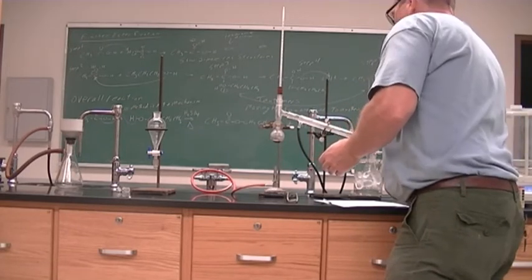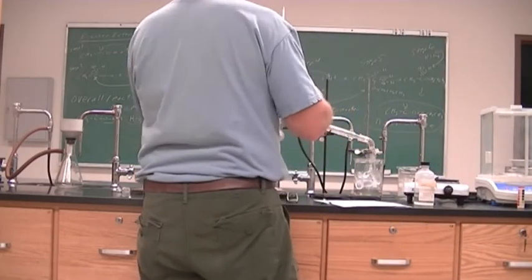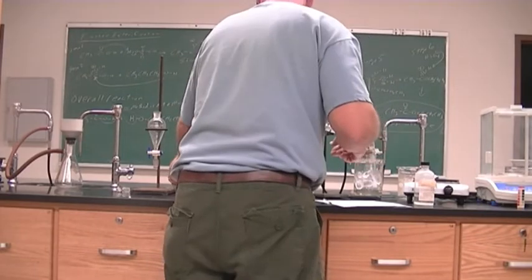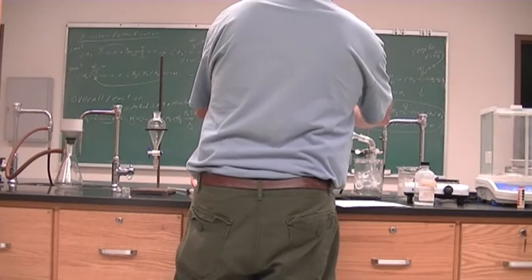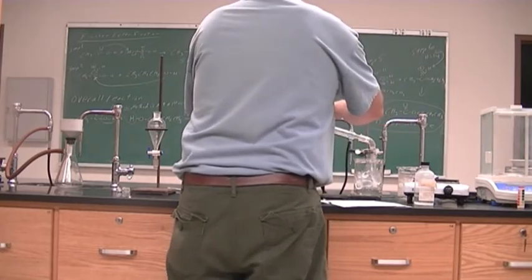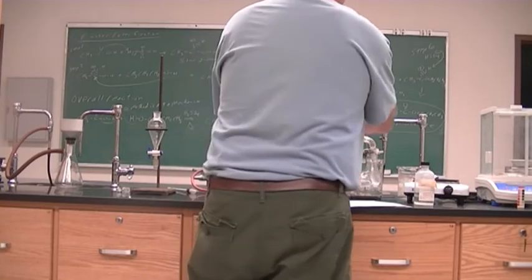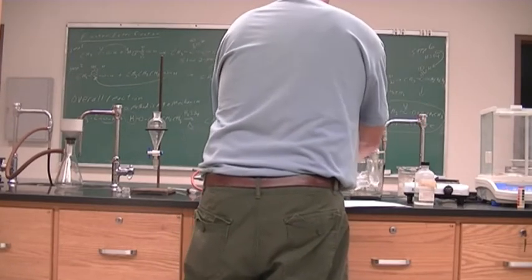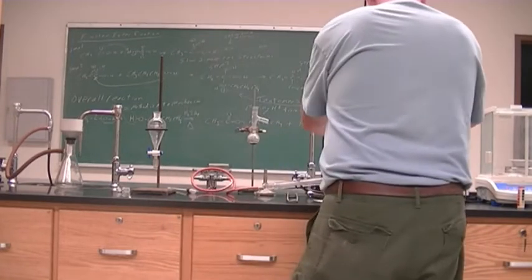Turn off the water and disassemble. This is pretty warm. All right, so this is the part we need.